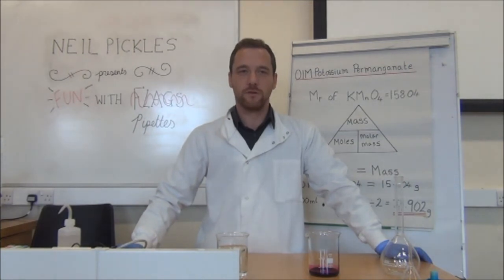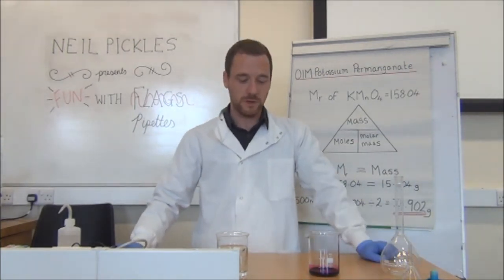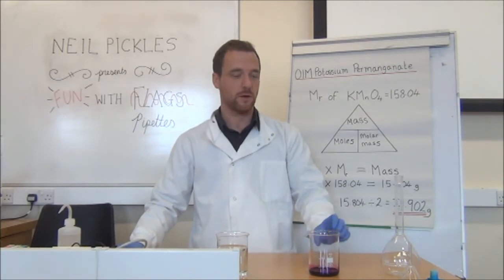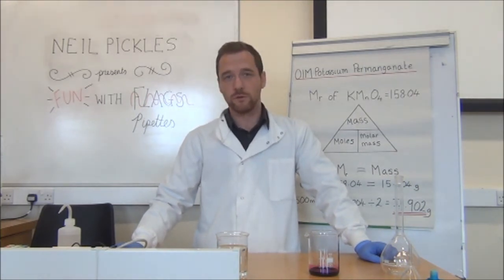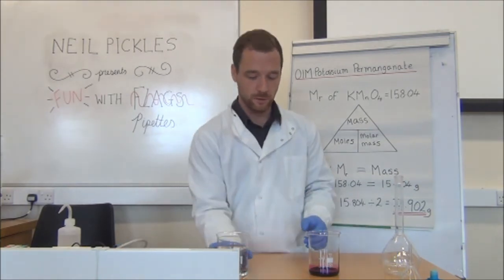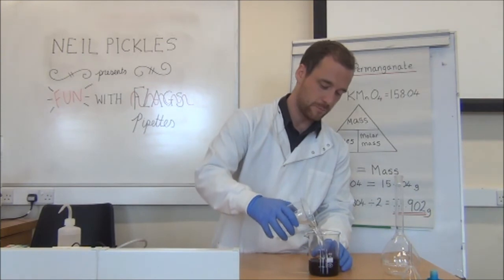So we've transferred the solid and done some washing into the beaker, and it's important to allow the solution to dissolve in a smaller volume in a beaker before we transfer to the volumetric flask. And partly the reason for that is your solution may need some adjustment, such as pH adjustment, so it's important that you make it up at a smaller volume first to allow it to dissolve.